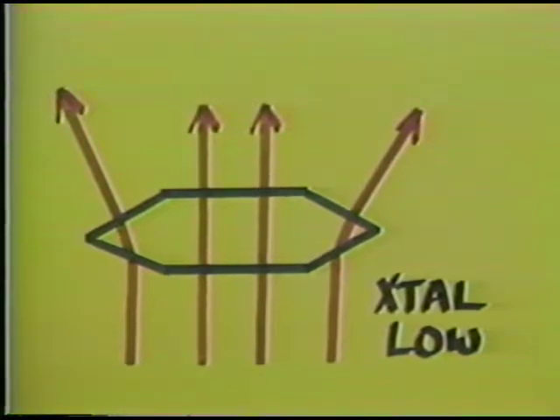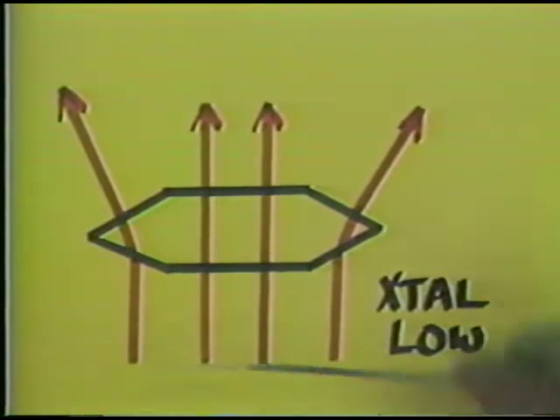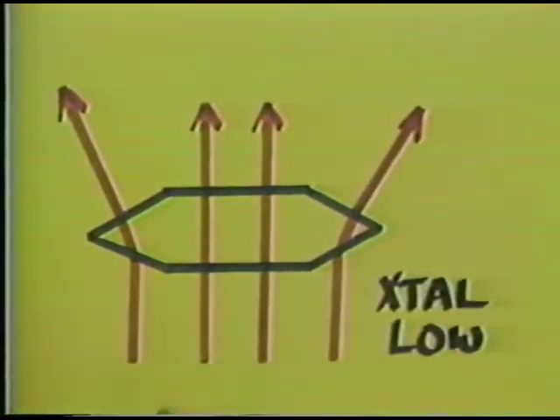The point here is that what I've done is illustrated something that occurs completely within the immersion mount. That is, the whole area that I'm showing here is within the immersion mount. And this area surrounding the crystal represents the immersion liquid. And this black outline represents a crystal.